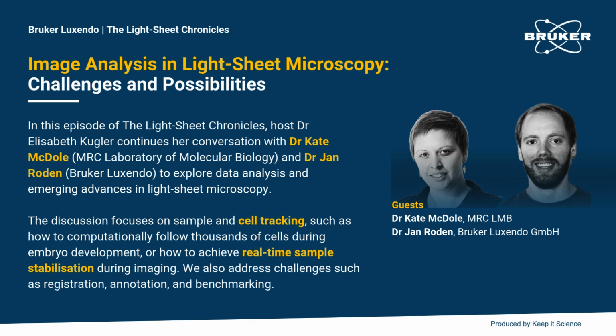And so having repositories, like some of the things EMBL or the IDR is doing, where you can put the data online and other people can access it, it's nice to see more of those initiatives going on. It would be great to have more of those. I think ultimately this is not just a problem for light-sheet, but globally we're running into the problem of how to do cold storage, not only for energy efficiency, but also because of the amount of data that we have. So for these light-sheet data sets, that are already on the order of a terabyte to 50 terabytes, that can exceed the capacity of most labs.